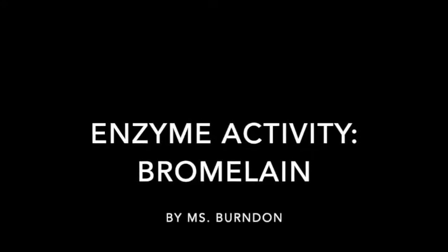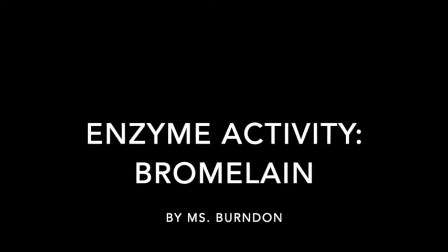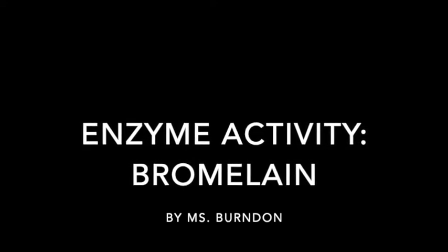In this lab you will be testing the enzyme activity of the enzyme bromelain. You'll be extracting the bromelain from pineapple and testing whether or not it remains active.